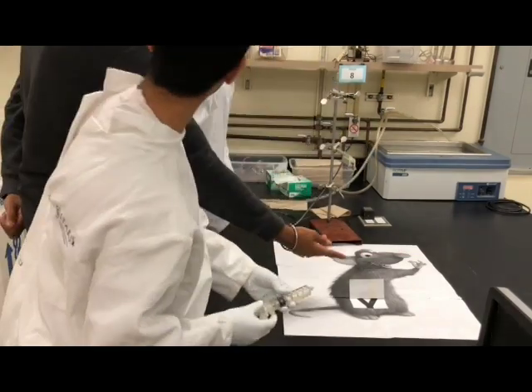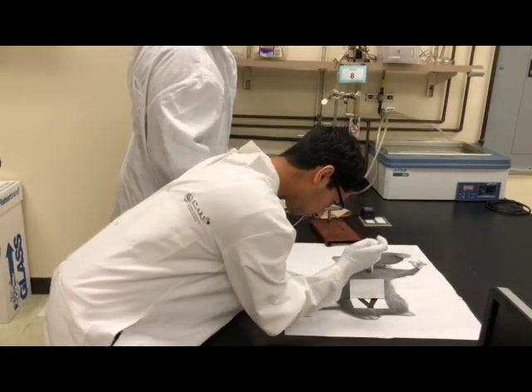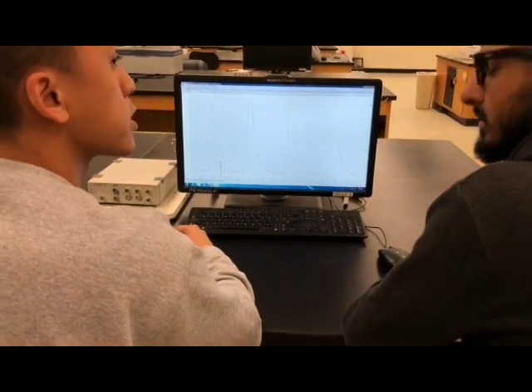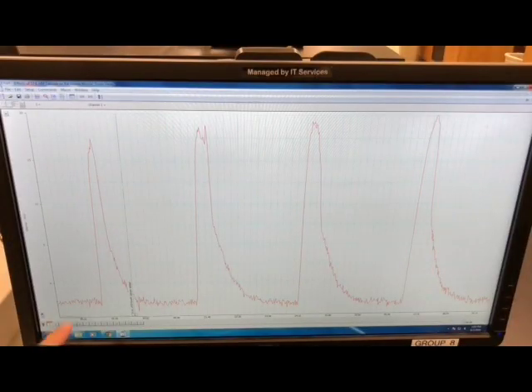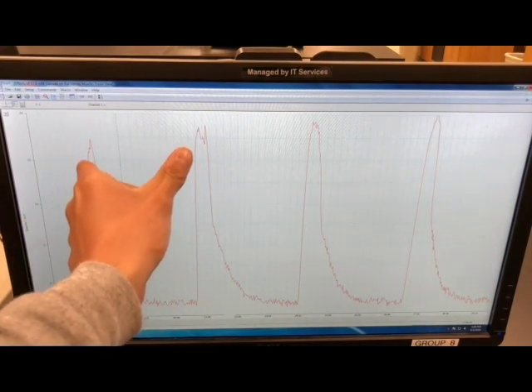Go ahead and administer the drugs, doctor. Doctor, both the amplitude and frequency have increased after the addition of calcium, but they appear to be too high. There's no way these values can be that high. How did you measure them? Doctor, we measured it by using the baseline right here, the amplitude right here, the duration right here, and the period used to find the frequency.